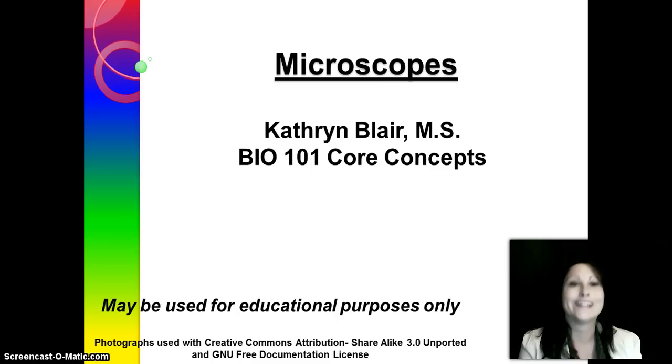One of the concepts that you are guaranteed to hear about in Bio 101 lab is going to be about microscopes. So the next 10 minutes or so, we're going to talk about what the parts are, what they do, and how to use them.